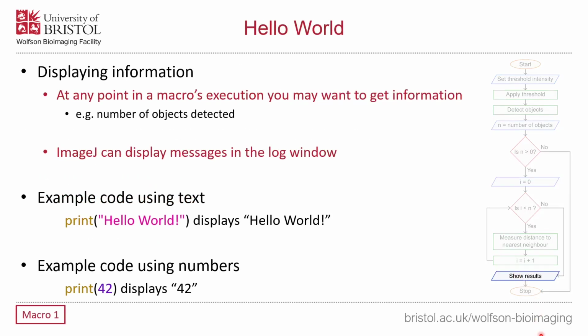And of course, the logical place to start here is right at the end. In fact, the sort of classic way to look at any programming language for the first time is to generate what's called a hello world code. All this does is you just want to use the minimal amount of effort in your program, or your macro in this case, to display the words hello world in the output. The idea of doing this sort of in general with programming is it just gives you a bit of an idea of what's the minimum syntax required or minimum structure required in your code to make it run anything.